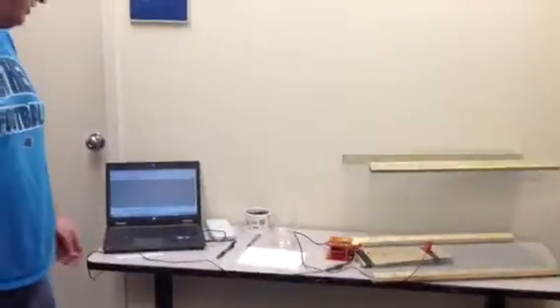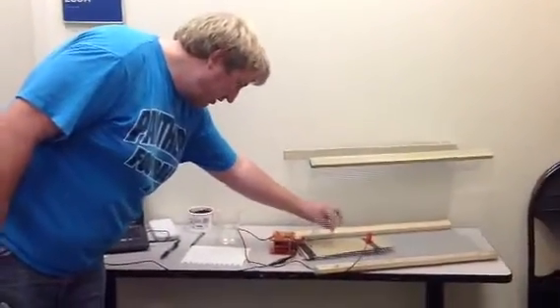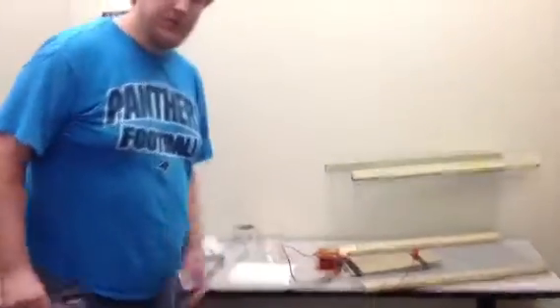And I'm going to measure the time difference between one electrode at the posterior end of the worm and another electrode that's towards the anterior end. And that time difference will tell me how fast it traveled that distance. So then I divide the distance in meters between these two electrodes on the worm by that time difference. That'll give me the conduction velocity.